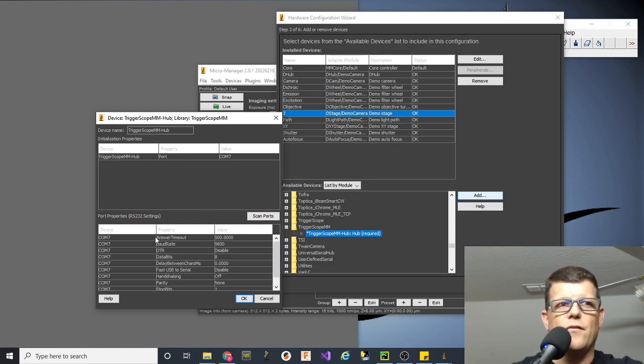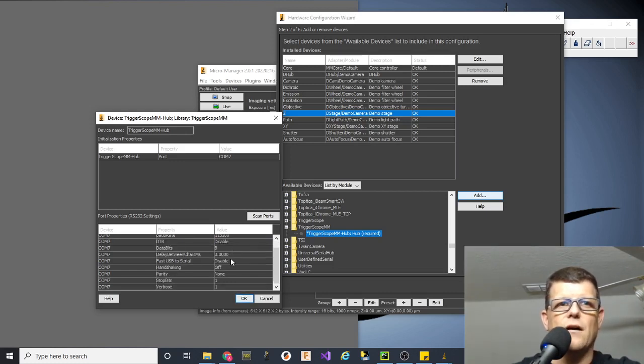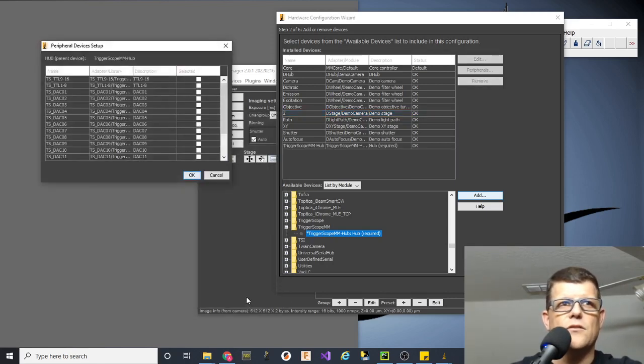All right, a little bit farther down, you can choose almost any baud rate, but the primary baud rate that this unit was designed to interface at is 115.2. So I'm going to choose that. That's the communication speed. Everything else here you can leave as default. If you'd like, you can turn on fast USB. All right, so we'll talk to the Triggerscope.